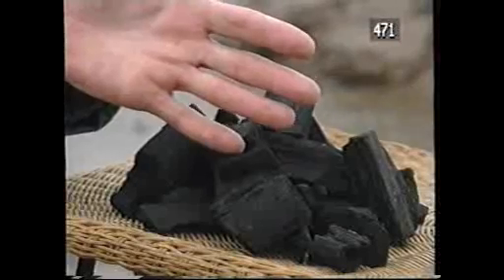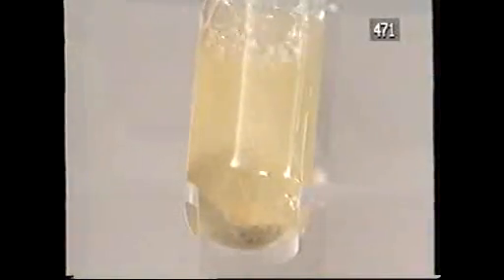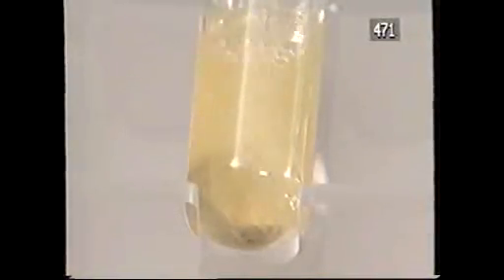Charcoal is nearly pure carbon. By burning it in the oxygen of the air, I can make carbon dioxide. And carbon dioxide can also be made by the reaction of acids with limestone. To emphasize that it contains carbon and oxygen, I'll take it apart.